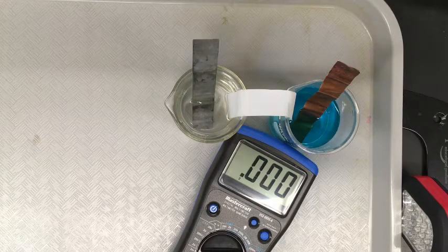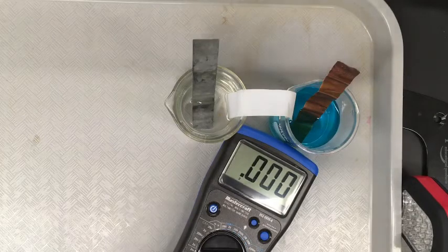So we'll use iron solution, a lead solution, a zinc solution, and a nickel solution. And we'll try out the changes in the voltage with that. We'll use the same concentration each time, 0.2 molar, so that they're equal across the 2 half cells.